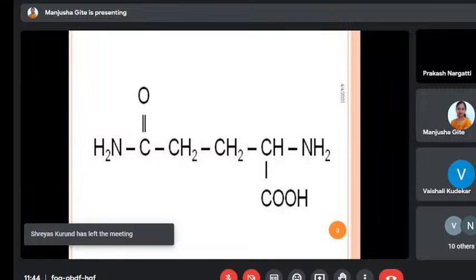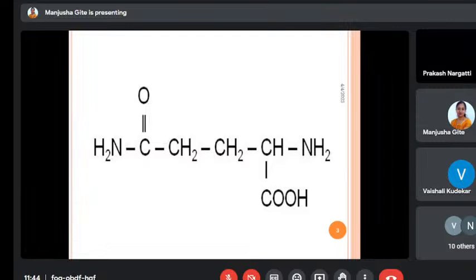You please tell them that the molecular weight of my compound is below 300. So they will scan only in that range. You will get your perfect peaks. Got it or not yet? I am just talking about the first application.